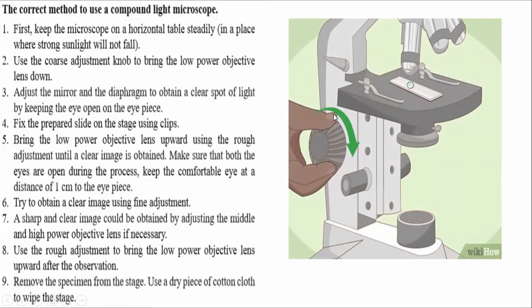This person is rotating it in order to move the low power objective lens downwards, all right, close to the specimen.